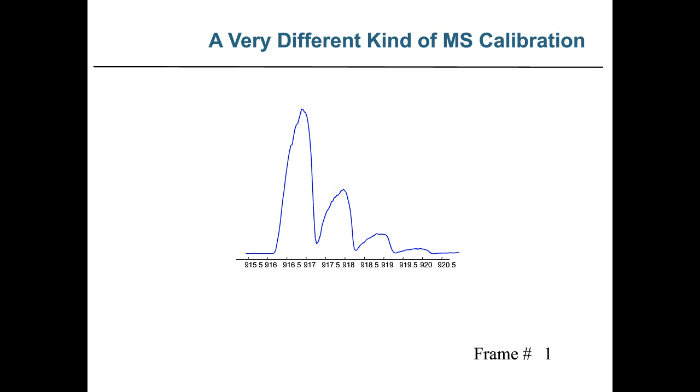It can be anything. It just has to be relatively close in mass to the ion that we're going to be ultimately analyzing. And the first thing we do is we estimate the approximate resolution of the data. That's pretty easily done. You look at the monoisotopic peak. And from there, what we do is we choose a mathematically defined line shape. It's a perfect line shape. It could be, for example, a Gaussian.